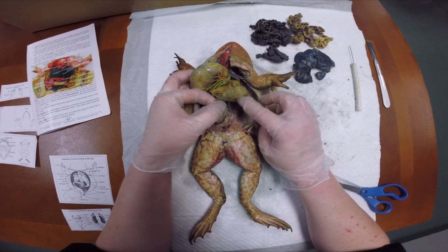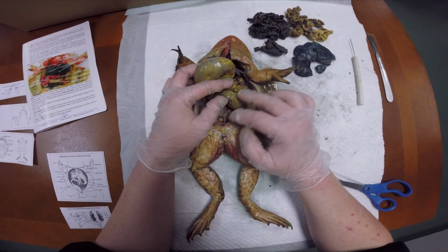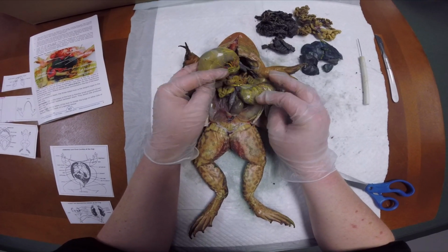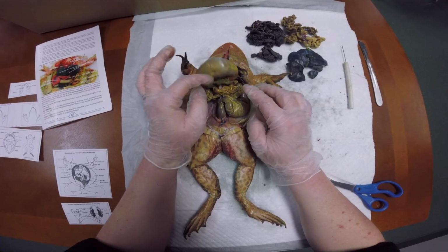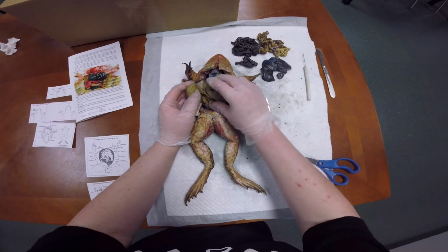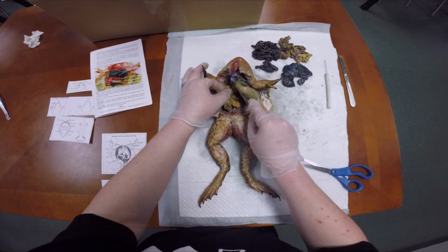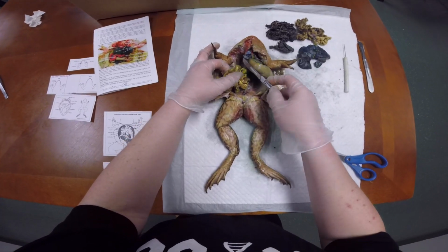Okay, this right here has to be the large intestine because I can feel stuff in there. So we're going to cut that and see what's in there before we cut the stomach. Then I'll be able to see the top parts better. I'm going to do a very gentle cut.